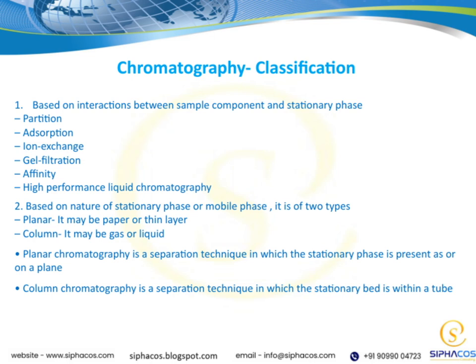Gel filtration separates based on size, with larger molecules eluting first. Affinity chromatography is highly specific, utilizing biological interactions. And finally, high-performance liquid chromatography, or HPLC, offers high resolution and speed for separating complex mixtures.